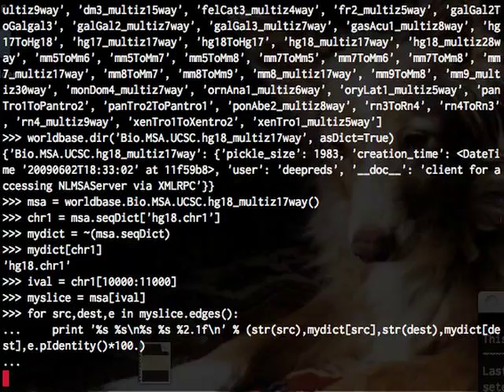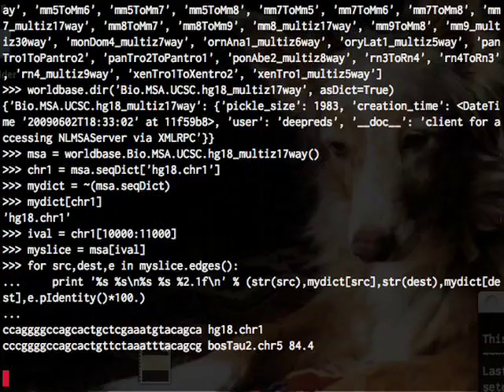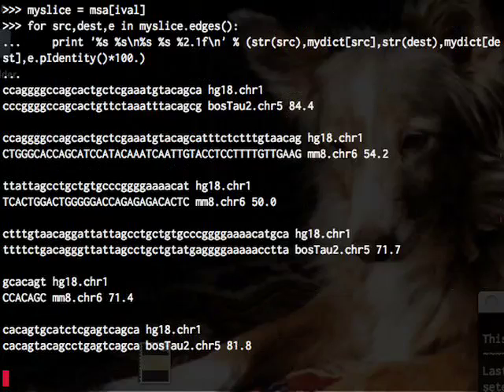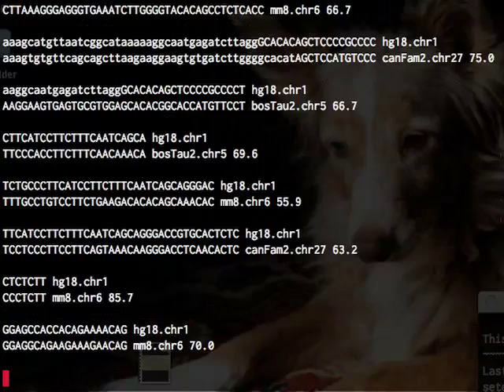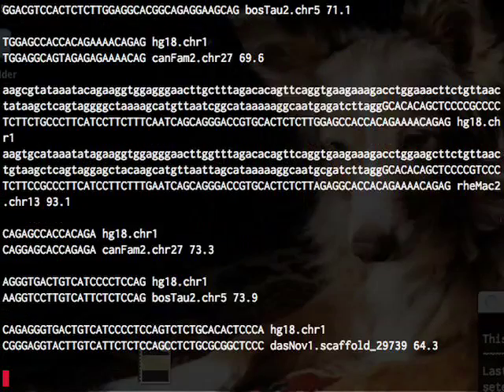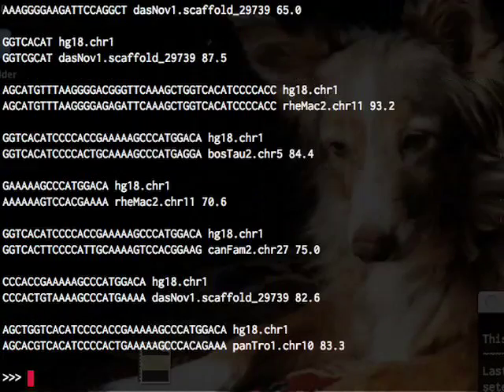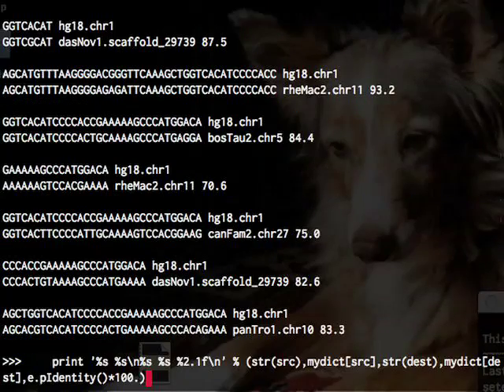So now it's going and querying back to XML RPC services and getting us all of our alignments.